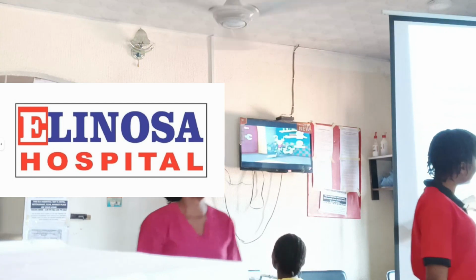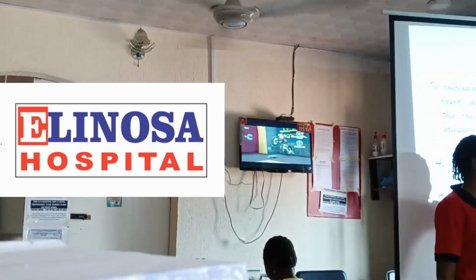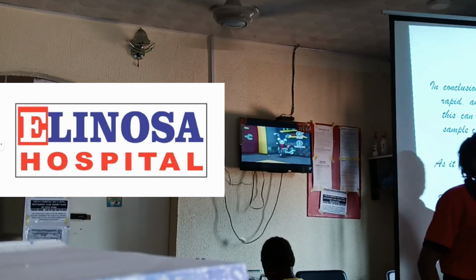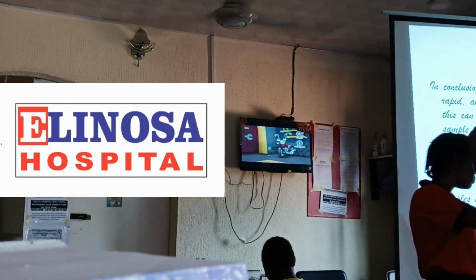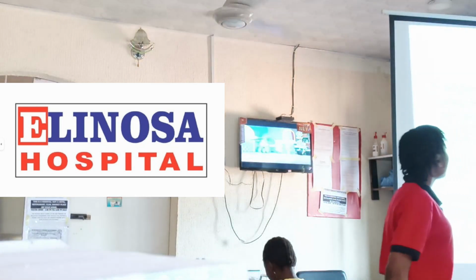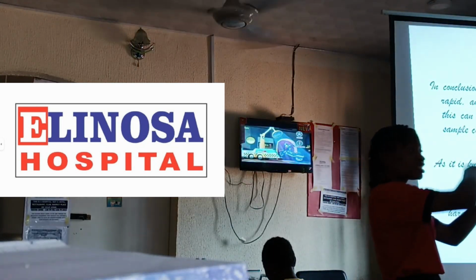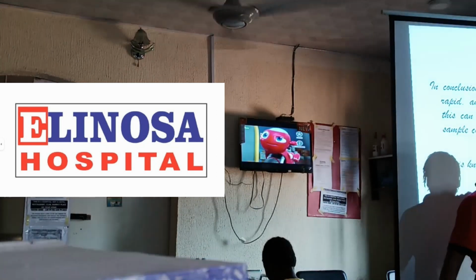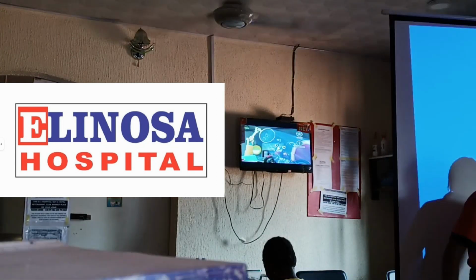Also, it is known that a test result is as good as the sample itself. This is trying to say that, for example, I want to check for tuberculosis in sputum. The patient is bringing saliva. I will run the test and I will not see tuberculosis inside. Why? Because the sample that was brought is not what I am looking for.